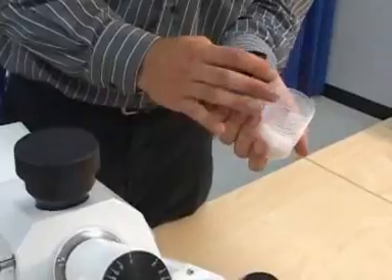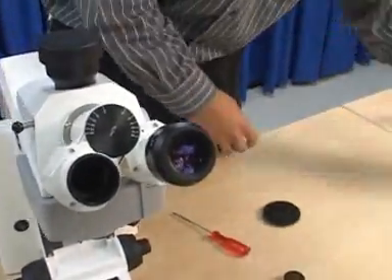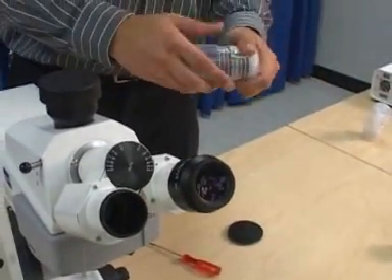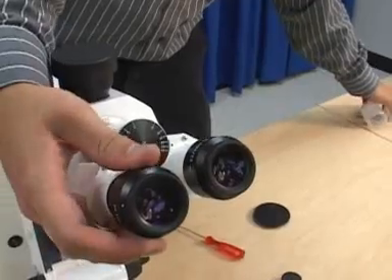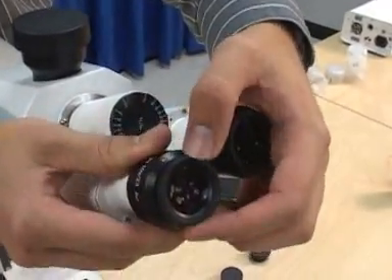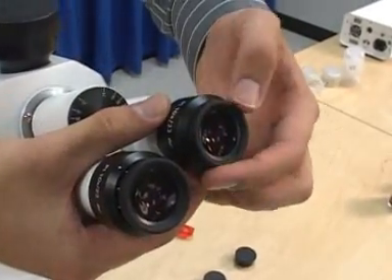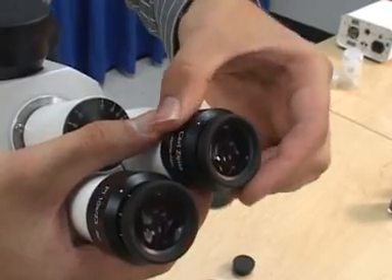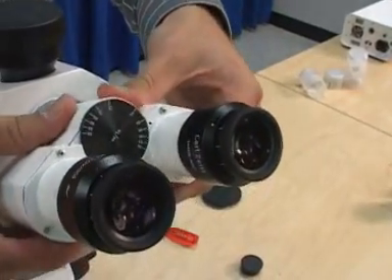Remove the eyepieces from their containers and push them firmly into the eyepiece tubes. Check that the zero position on the eyepiece is aligned with the white dot on the barrel of the eyepiece. If the eyepiece was ordered with a reticle installed, then the zero should be aligned with the red dot.